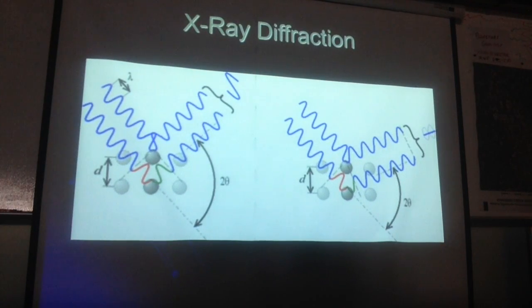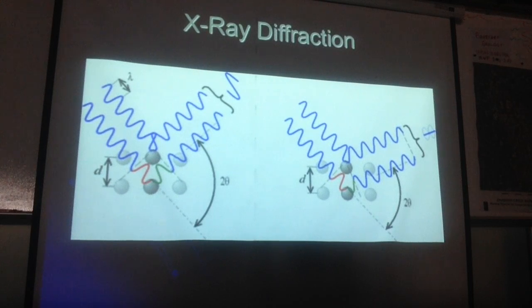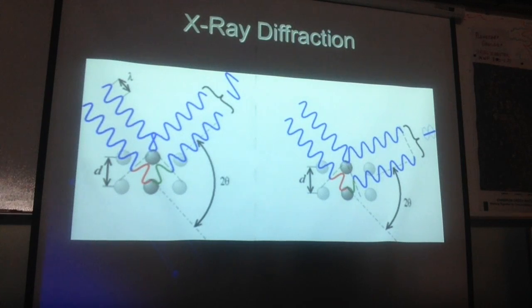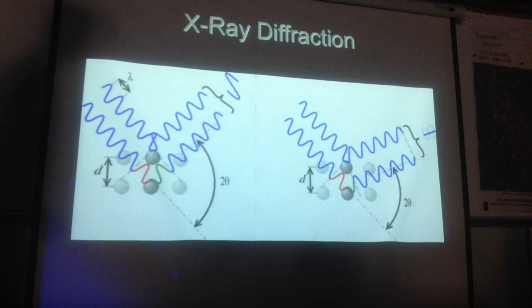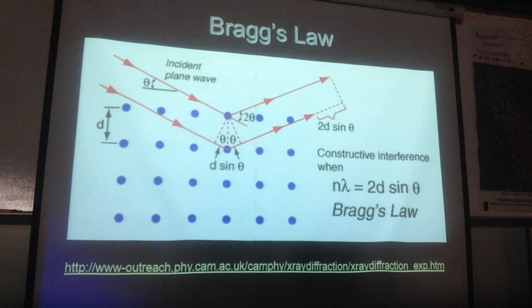And sometimes you'll see or hear someone refer to D-spacing. That refers to the space in between each individual atom that makes up the crystalline structure. So depending on your mineral, your D-spacing will be different.